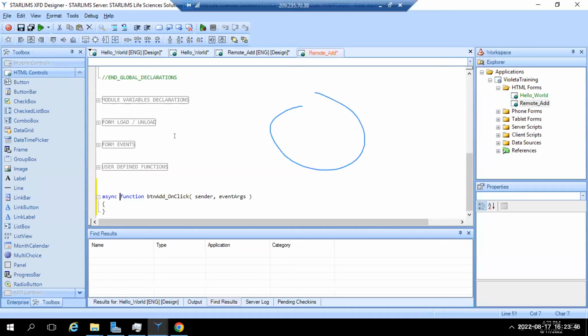Perfect. Give yourself some space here. Do a new line and start typing. We're gonna declare 3 variables. So do var first num, and then the naming convention: if you're expecting a number, start it with an n. So lowercase n, erase the equal to.